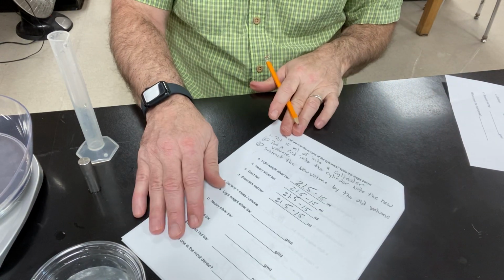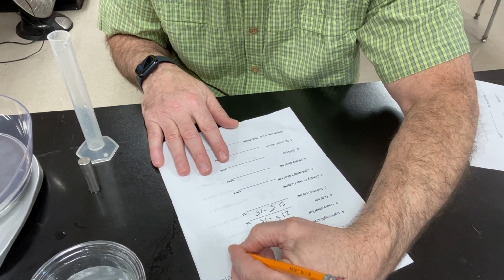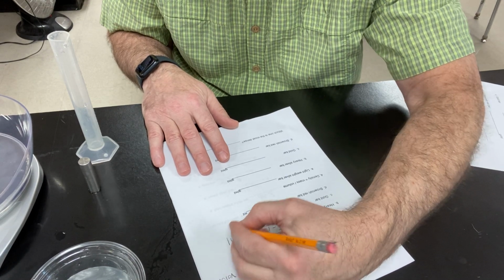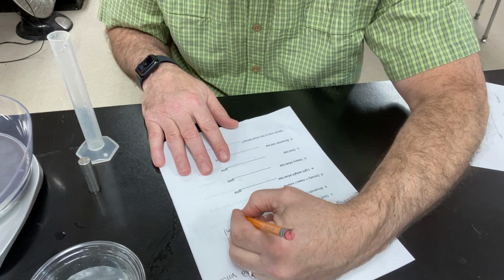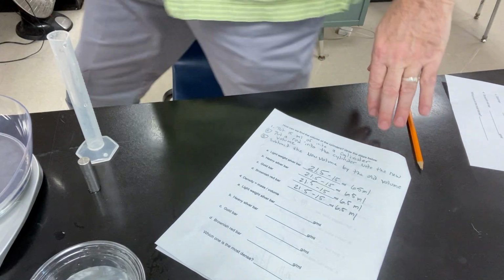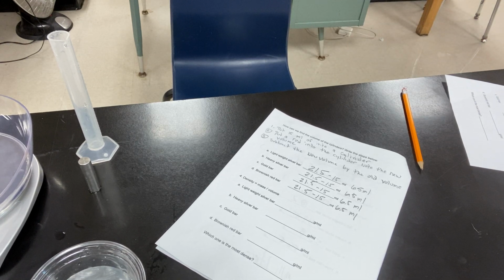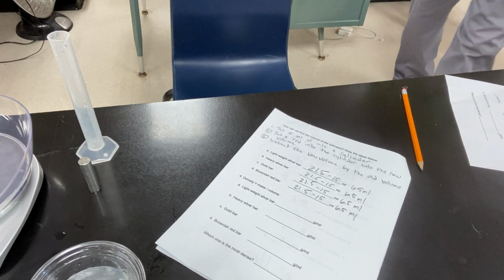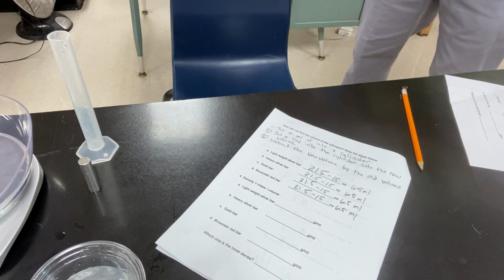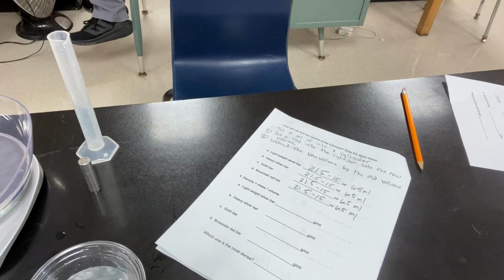Okay? So that makes our volumes all 6.5 milliliters. 6.5 milliliters, all the way down. Okay, great. And I also have to find the density, and to find the density, I gotta do math. Where's my calculator? There it is. All right, so I got my calculator. Hopefully I can get it open. Apparently not. Well, I'll use the little one. Here we go. Okay.